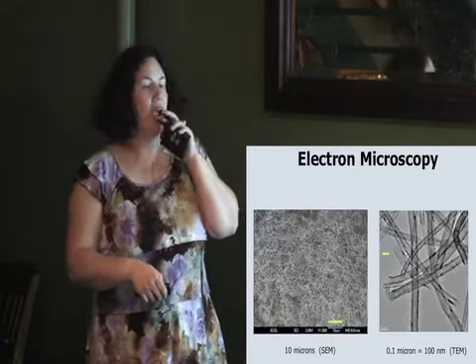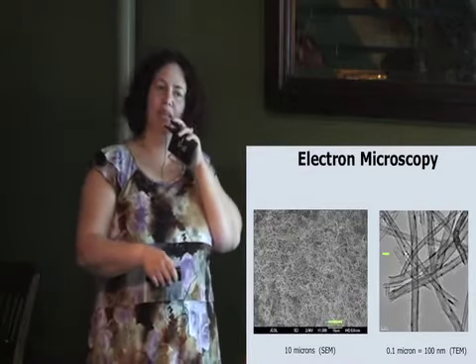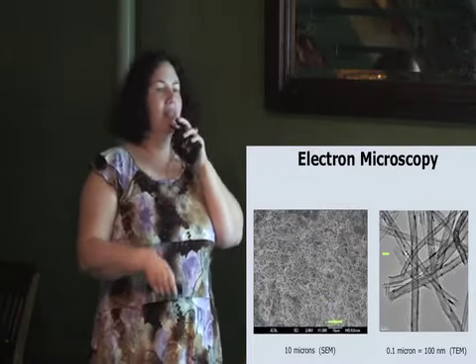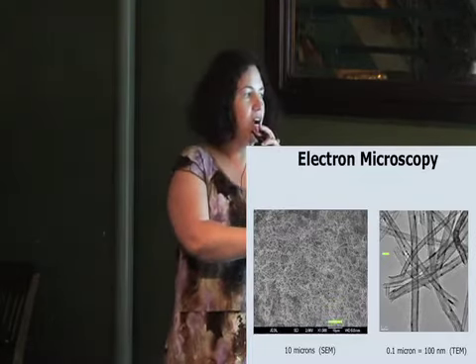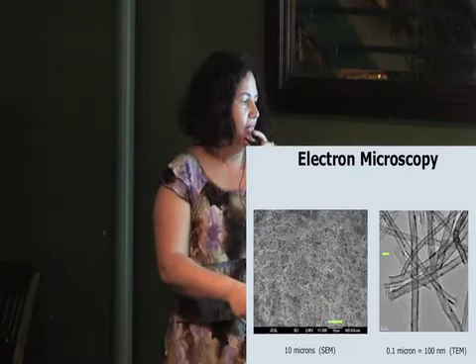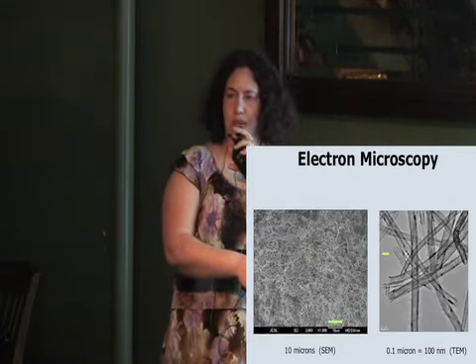These are carbon nanotubes, another material that is getting common nowadays. Basically, tubes, nano-sized, and made of carbon. Here the bar is 10 microns, so it's a very, very thin hair. This is the scanning electron microscope mapping the surface of a substrate that had many of these.